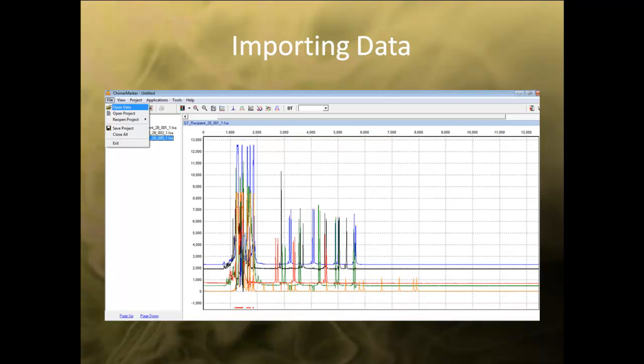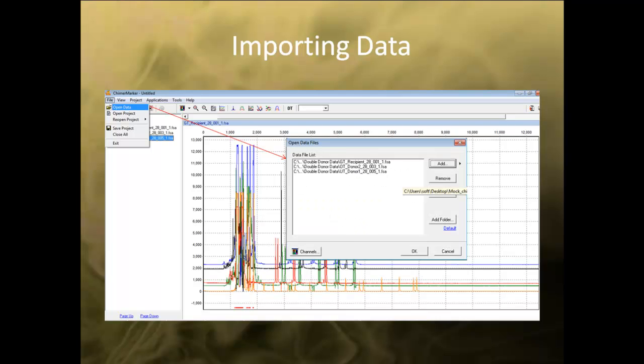To import data into ChimerMarker, use the file drop-down menu and select Open Data. In the dialog box, click the Add button to import samples into ChimerMarker. You can also remove files by selecting the sample and clicking Remove. After you have finished selecting your files, hit OK to begin the import.